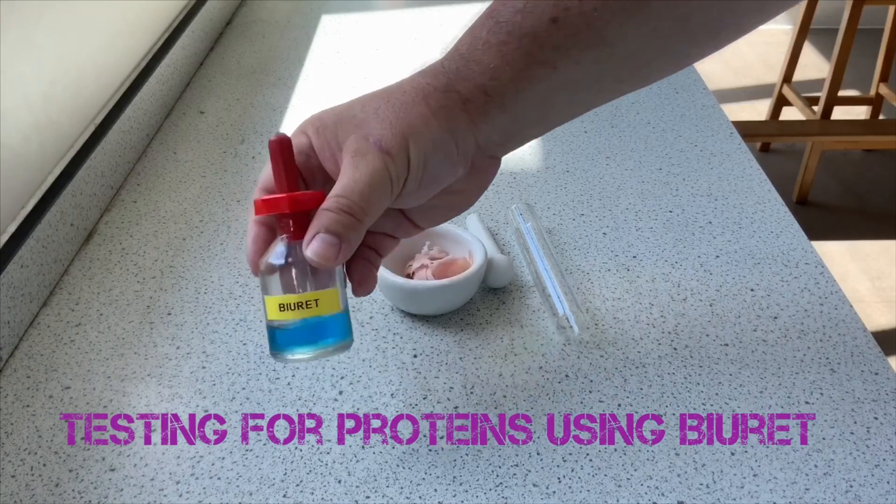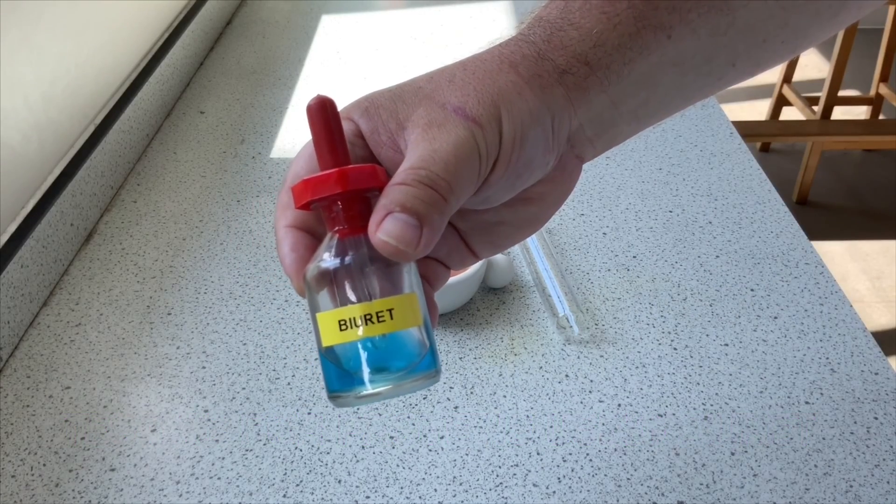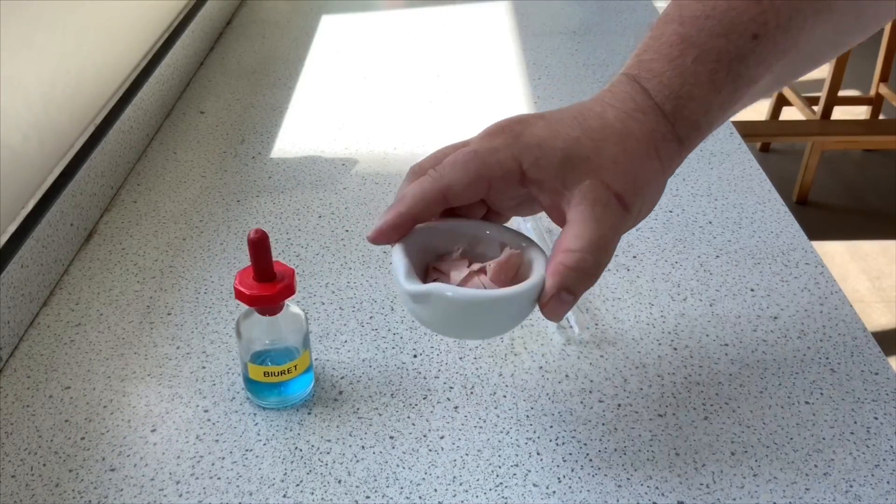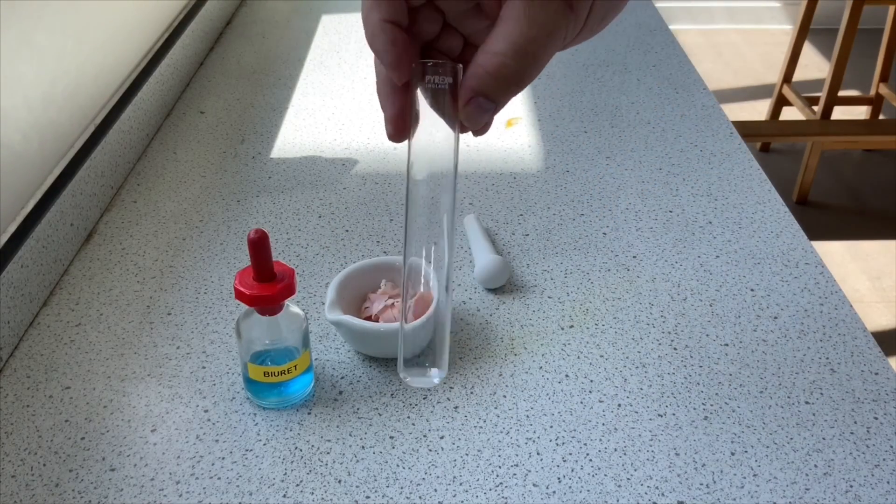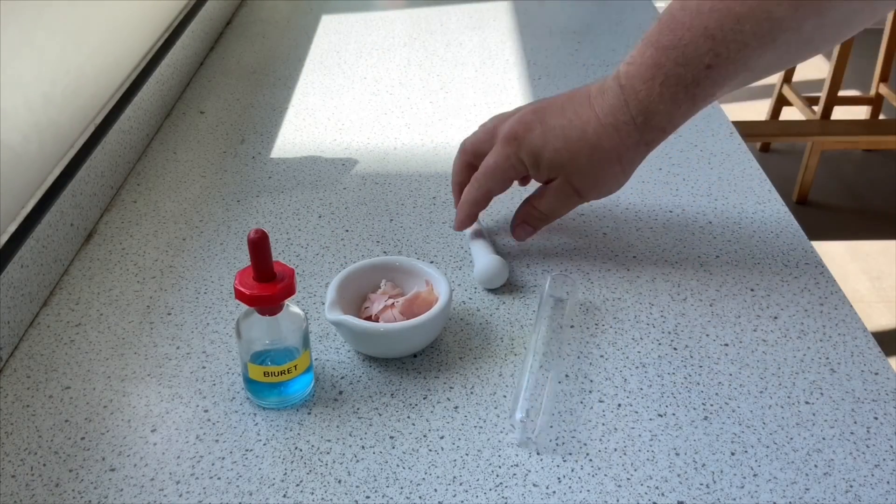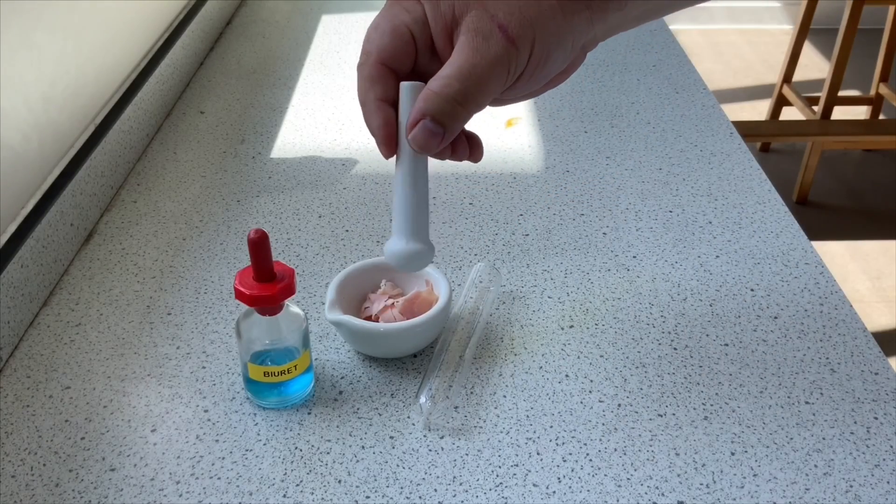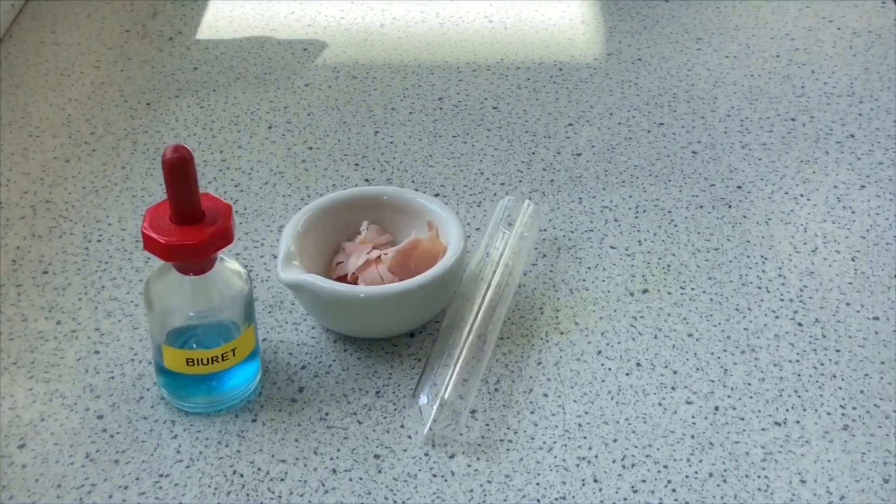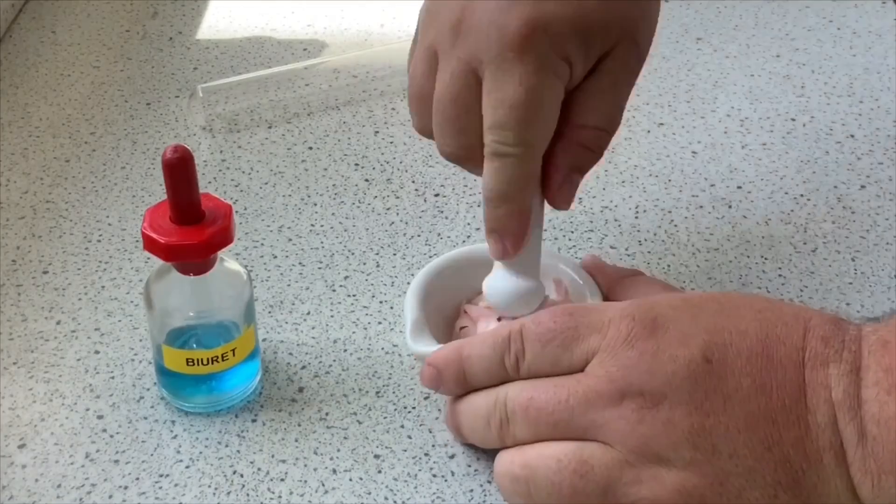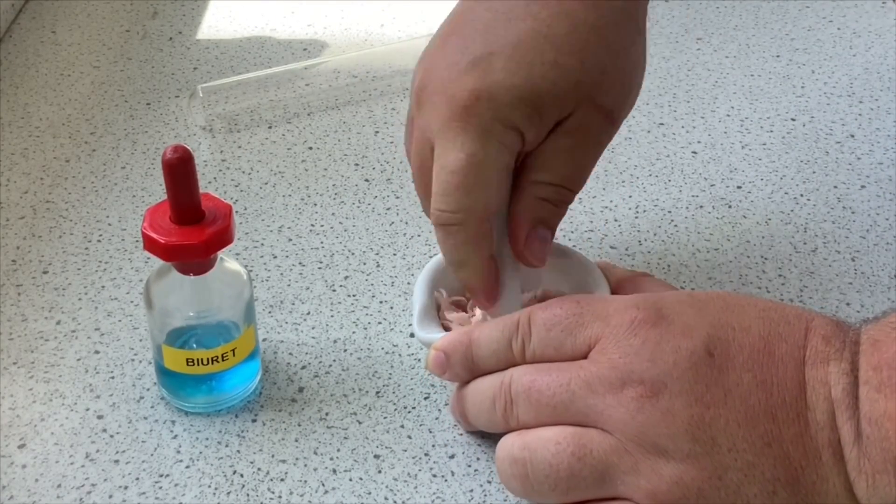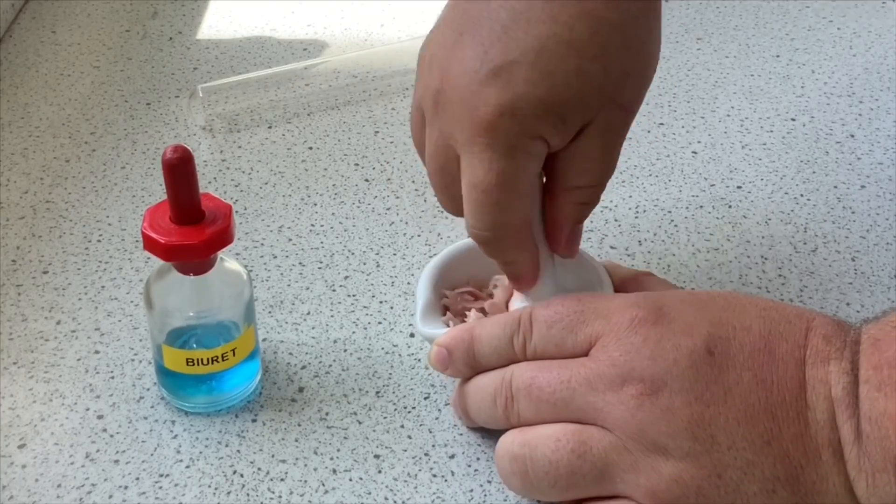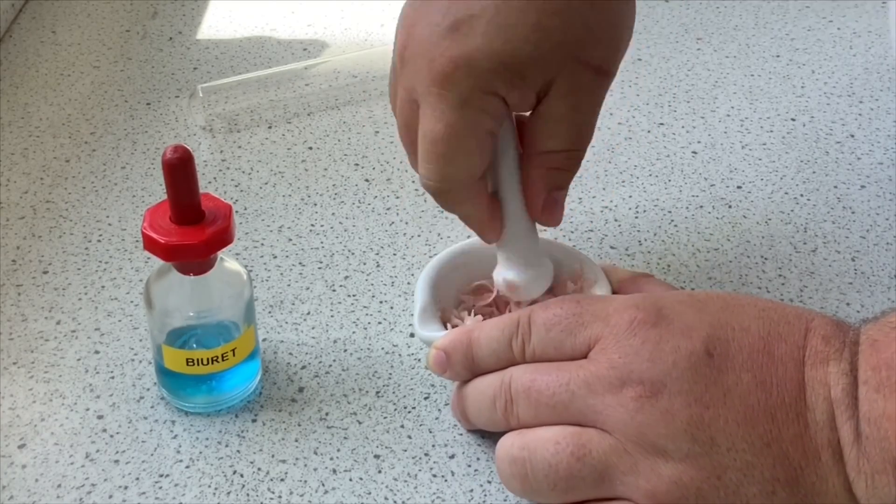Next one is a test for protein. This is called Biuret reagent. Again, it looks like Benedict's. I've got some ham here, a mortar and pestle, and then a boiling tube. The first thing I've got to do is crush up some of this meat here to try and release some of the proteins from it and to get it into sort of a solution mix.